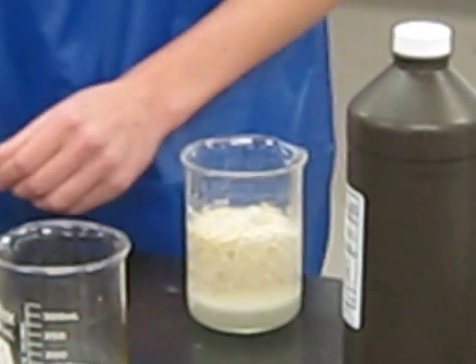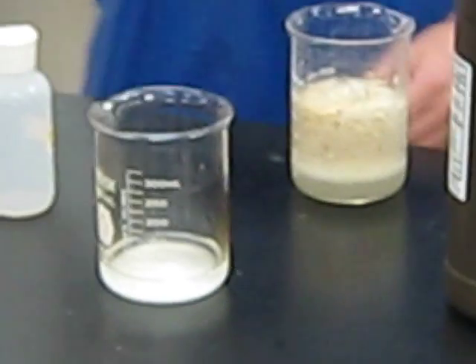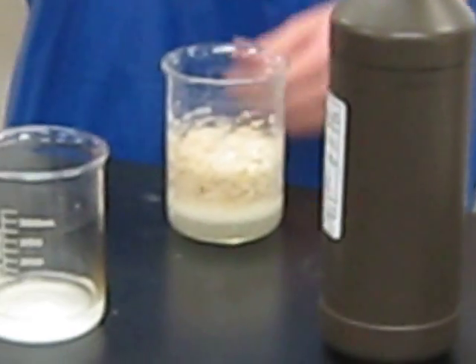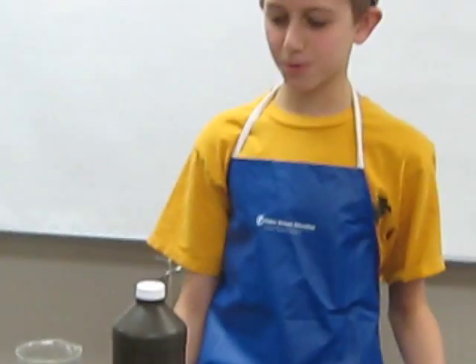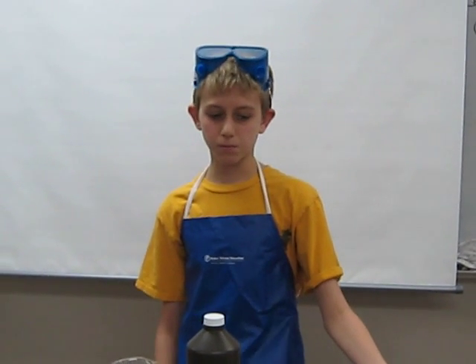I'm going to re-light it because it went out. The first time, when we put the burning splint into the mixture, it went out because the carbon dioxide didn't let the flame burn without any oxygen. The second time, oxygen was produced, and therefore the burning splint burst back into flame.